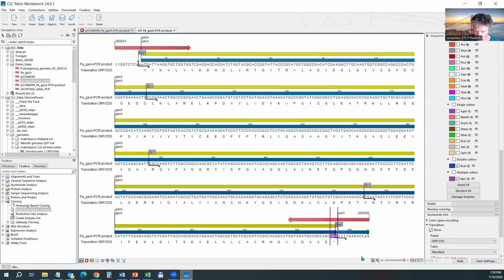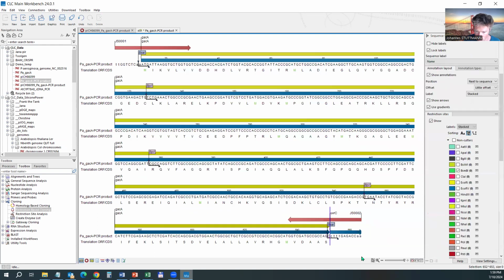And I also don't really need this. So maybe I can just keep the restriction site here and the additional nucleotide, but all this has to now be replaced. So we have a CAGC, which is a serine at the very end of GAG-A.